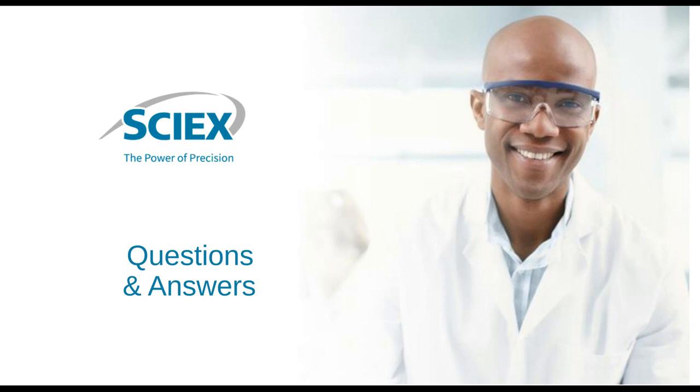Yeah, I think the system I've been using, your SDS molecular weight kit, comes with standards which start at 10 kilodaltons. So again, I guess it depends what you want to do with your samples. If you want to see them on the system, then it should work. But if you want to get an accurate molecular weight, then I would say they're not large enough.